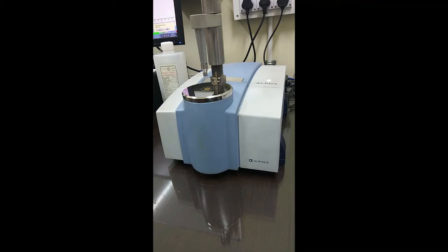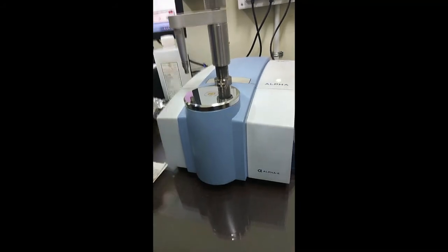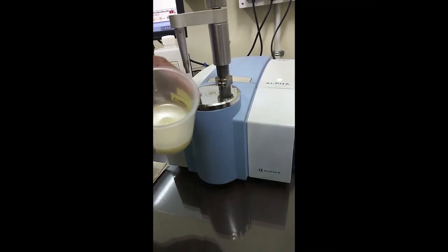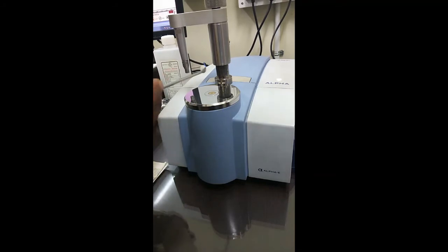There's one thing that we always take care of, which is the sample, especially the liquid sample that we are putting for sampling. The pH of them should always range from 5 to 8. Let's now load this sample. The sample which we are using is an oleogel sample. This is a sample which has a semi-solid texture. So we'll take a tiny amount of sample with a spatula, and we'll put it at the ATR crystal, and we'll just firmly press the sample so that it makes maximum contact with the ATR crystal.